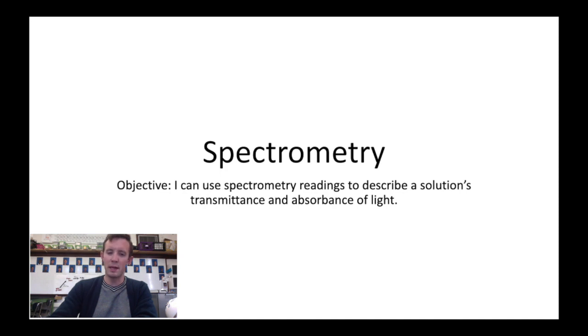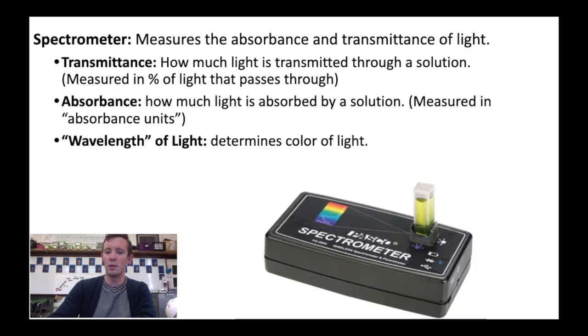Hey bio team. So biologists will often use light to measure biological reactions. And to do this, they'll use a tool called a spectrometer. And so I have a spectrometer here, and this measures two different things.